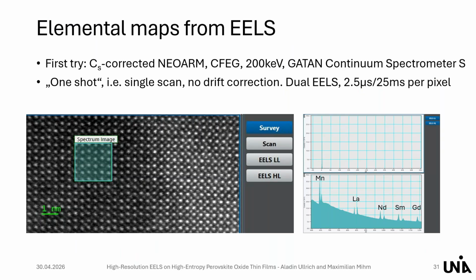Yeah, by focused ion beam technique, lowering the beam energy down to 1 kiloelectron volt. It takes some time, of course, and the first sample was not successful. We burned it away, and it took us, I guess, 2 or 3 samples until we got a good one.